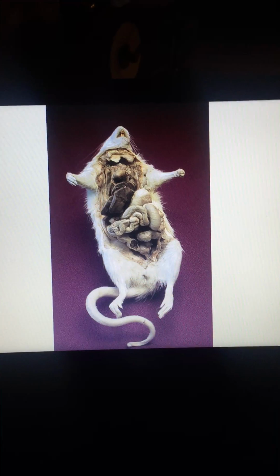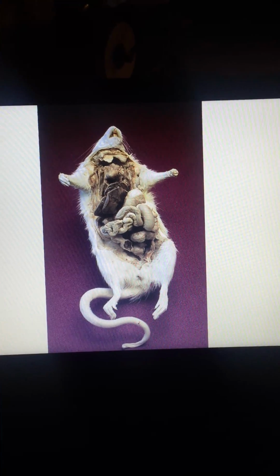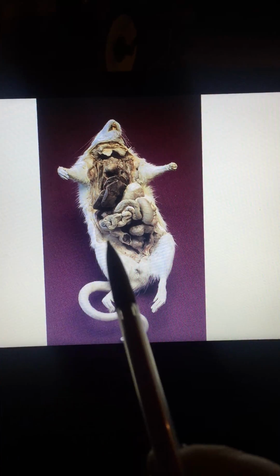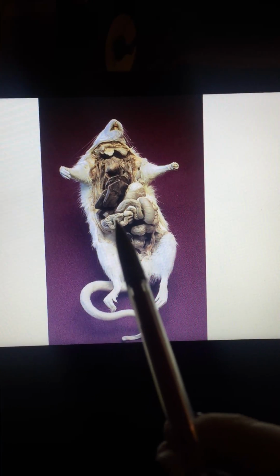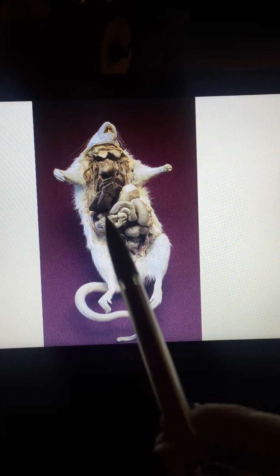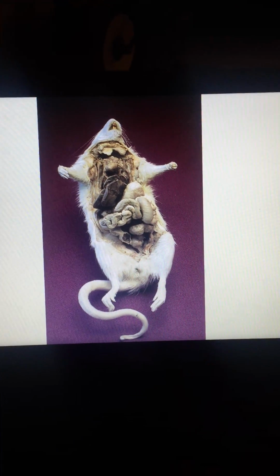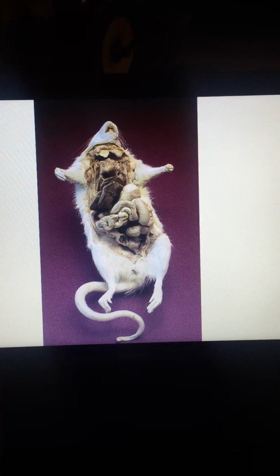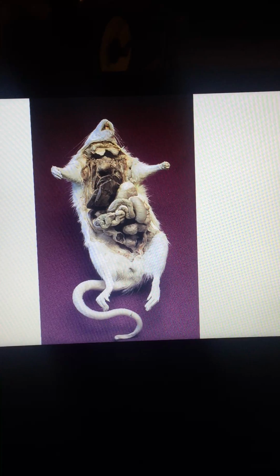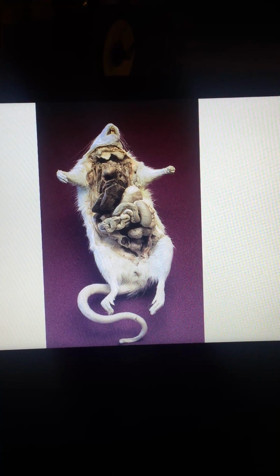The last organs you'll need to find are going to be the kidneys. You definitely can't see these here. You are going to literally have to scoop out those organs to the side of the tray when you're doing your checkout, and the kidneys are going to be underneath all of this, right along the back, along the lower abdomen. You might think the kidneys look almost like tumors along the back of the rat, like swollen masses, so it's an easy way to identify them.